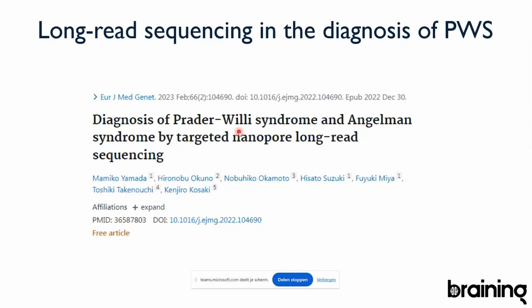And so more and more, in the lab, we work with a number of clinicians who are interested in genetic diseases, and they say that more and more long-read sequencing is going to be implemented in the diagnosis of patients. So this is a very interesting development in the clinic, where the emergence of a new technique really can make a difference in terms of cost effectiveness. But also, you can imagine that if you have a child that is sick, you want to know as fast as possible what is going on. And so this one test of long-read sequencing will be much faster than doing 4 different diagnostic tests, right?